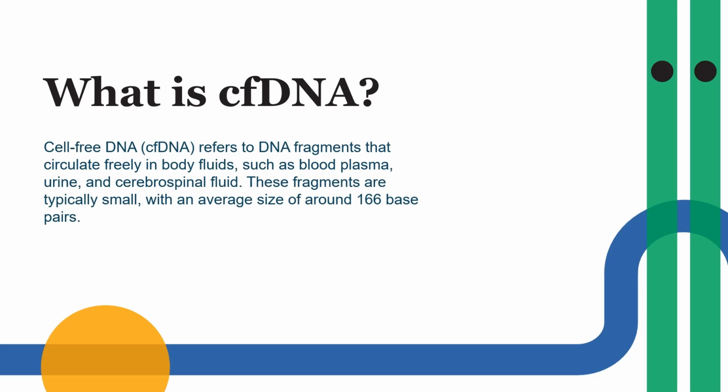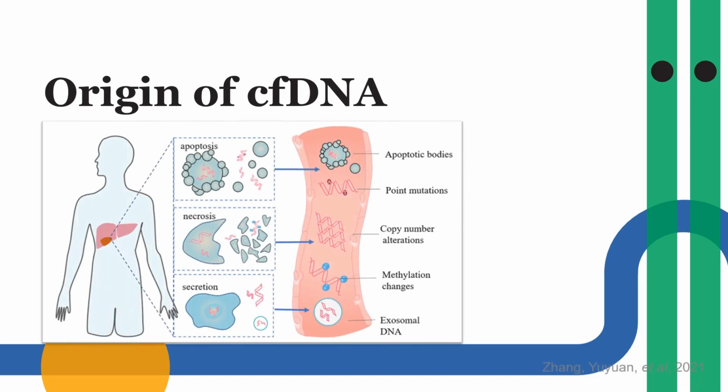In the past several years, there has been increasing enthusiasm for the use of cfDNA as a biomarker for cancer, with uses from diagnosis to prognosis to monitoring tumor evolution and response to therapy. The ability to detect and quantify tumor mutations from a blood sample, so-called liquid biopsy, holds great promise to revolutionize cancer management. Two possibilities exist for the main origins of cfDNA: cellular breakdown mechanisms, such as apoptosis and necrosis, and active DNA release mechanisms, such as exosomes, vesicles, and argonaute.